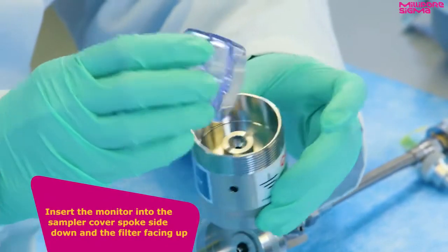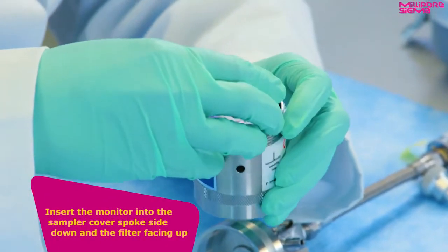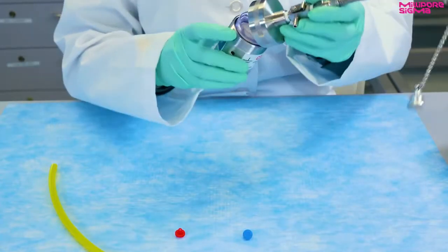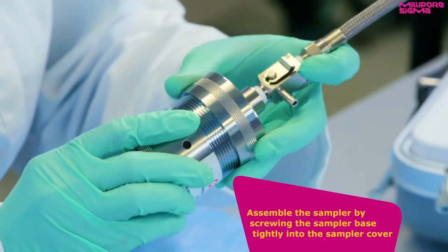Insert the monitor into the sampler cover spoke side down and the filter facing up. Assemble the sampler by screwing the sampler base tightly into the sampler cover.